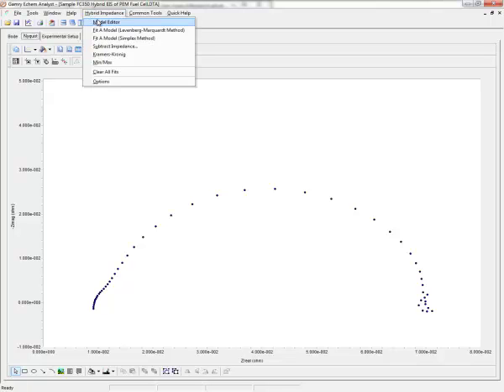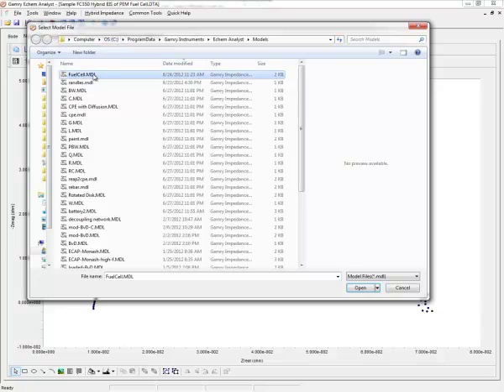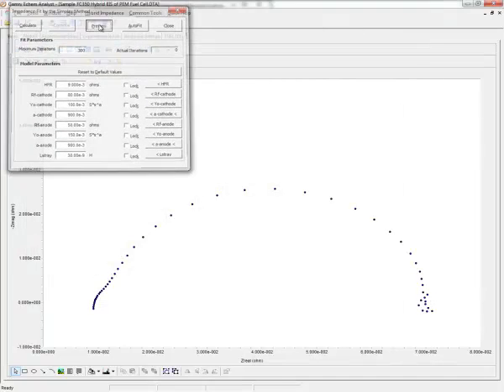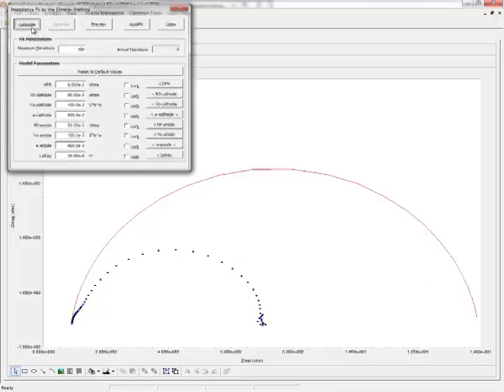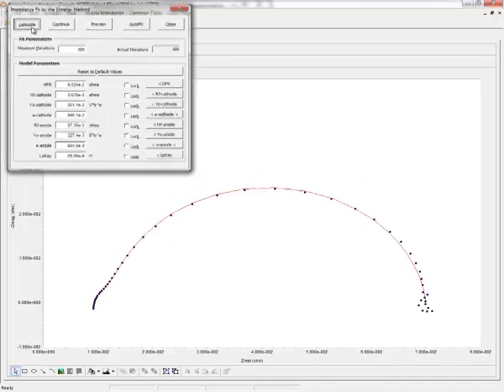Click on the Hybrid Impedance menu, fit a model, load up that fuel cell model, and then I would click on Preview to see how these default values would look. These values are close enough to the actual data that I can click Calculate and get a fit.